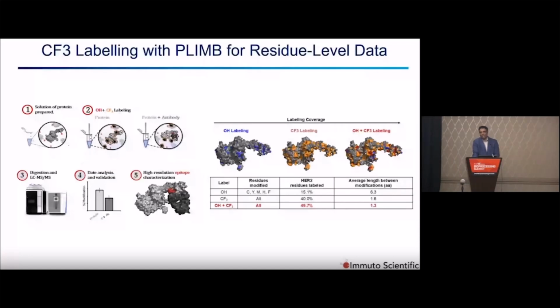Now, when you combine the analysis with hydroxy radicals as well as CF3, the coverage goes up to about 50%, with almost near residue level resolution for this type of analysis. So where do we actually use this?